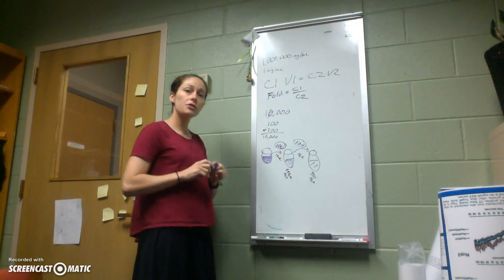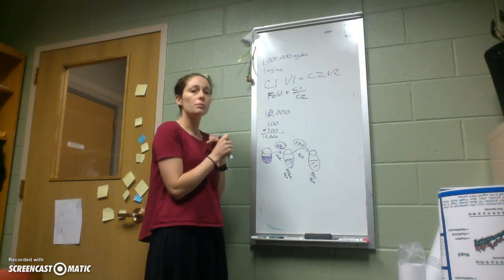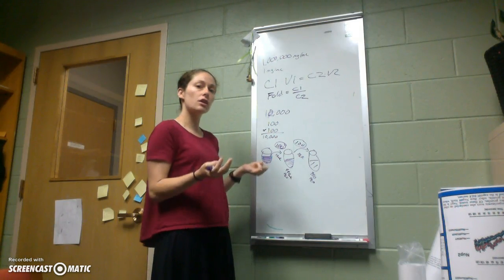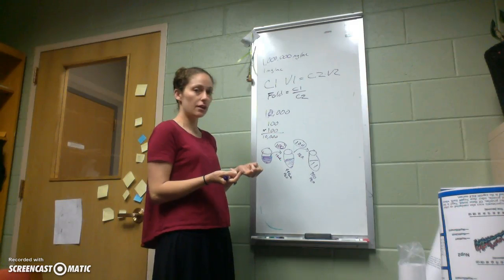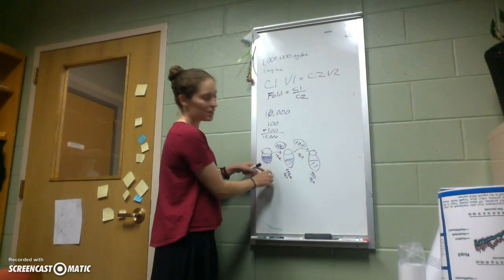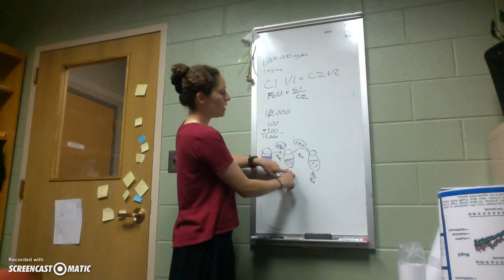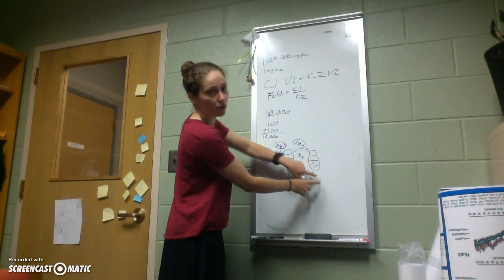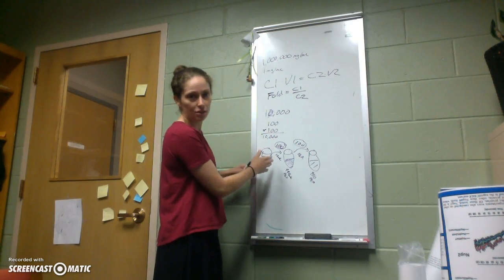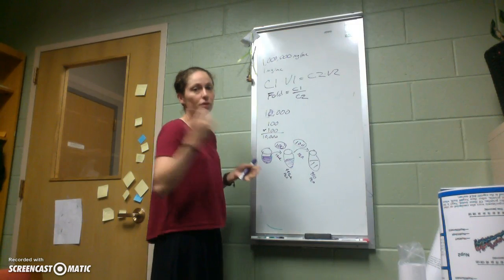With serial dilutions, the 2 important things to remember are, 1, you multiply your dilution factors or fold dilutions together to get the overall dilution factor. And the other is that in order for that to make sense, you have to take from one tube, dilute it, now take from this newly diluted tube and dilute that, use that for your next dilution. Some people get confused and continually take from the original stock, and then you're just doing the original 100-fold dilution every time. You're never multiplying that dilution.